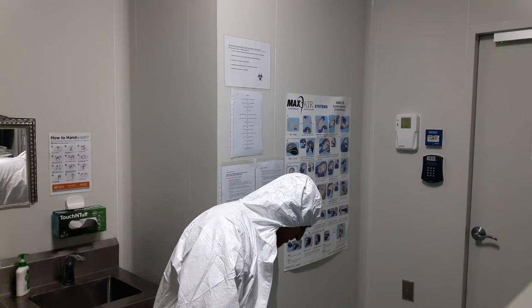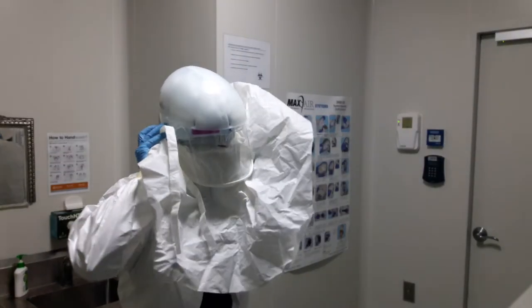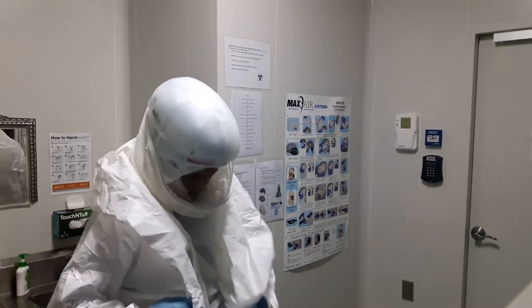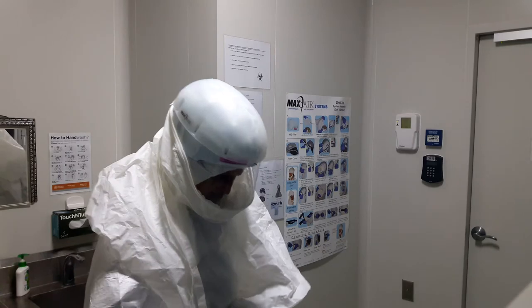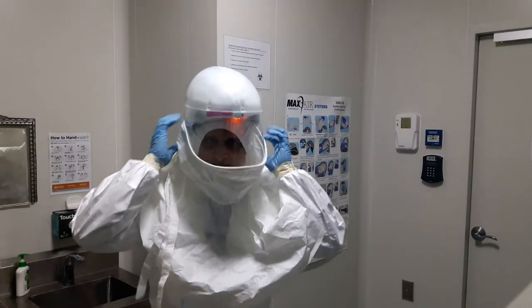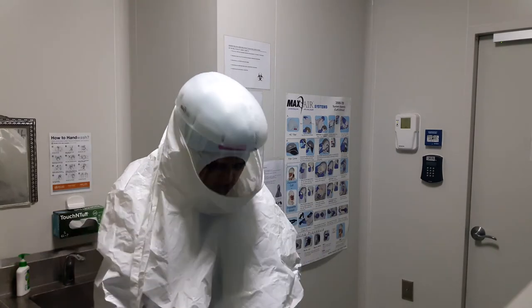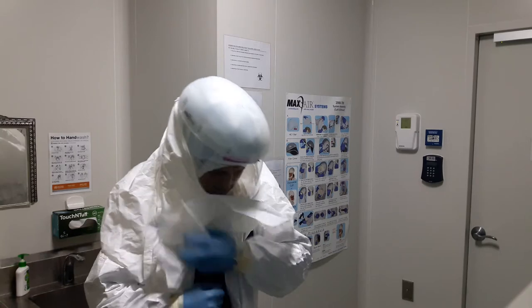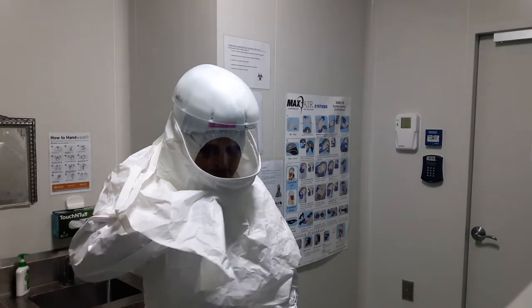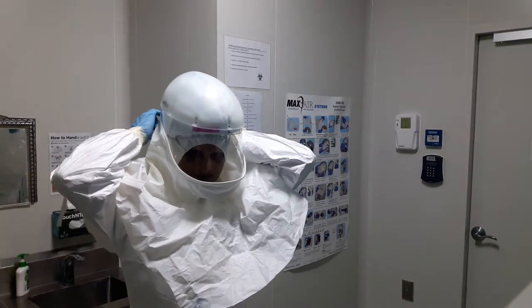I am going to zip up, but before that I am going to wear my powered air purified respirator. So the respirator goes on top of my head, sits there, and I turn on my power cable before I seal it. The power is now running, and I can see it running. Then I have to wear my shroud — I am going to zip everything up, putting the wires in, and zip up the system. Now I am going to fire my respirator.